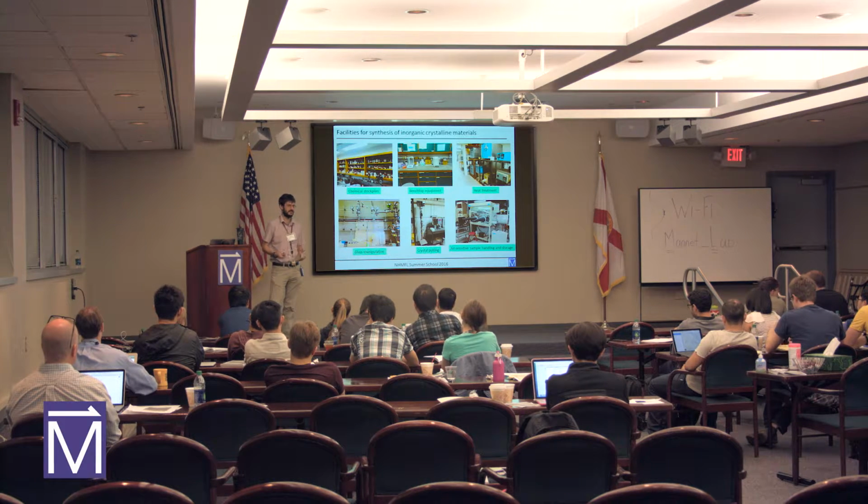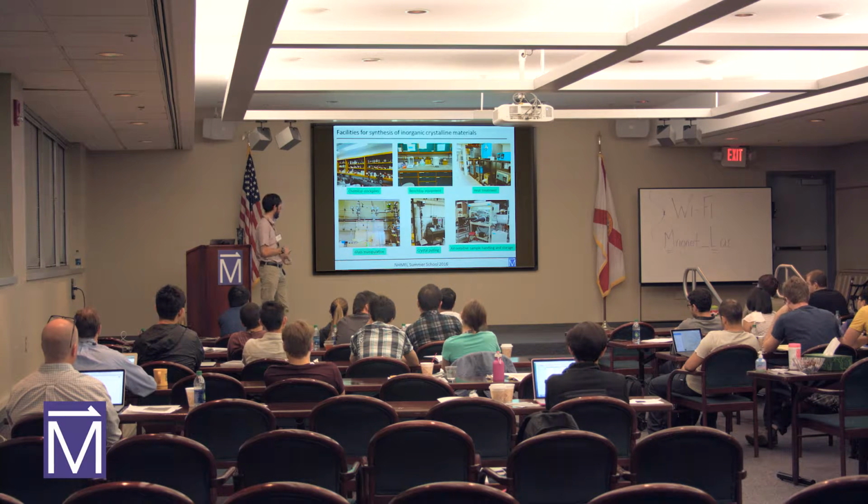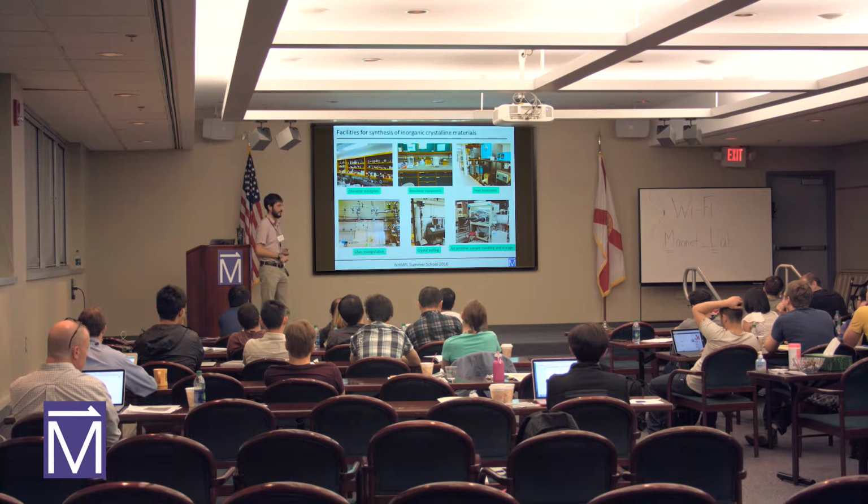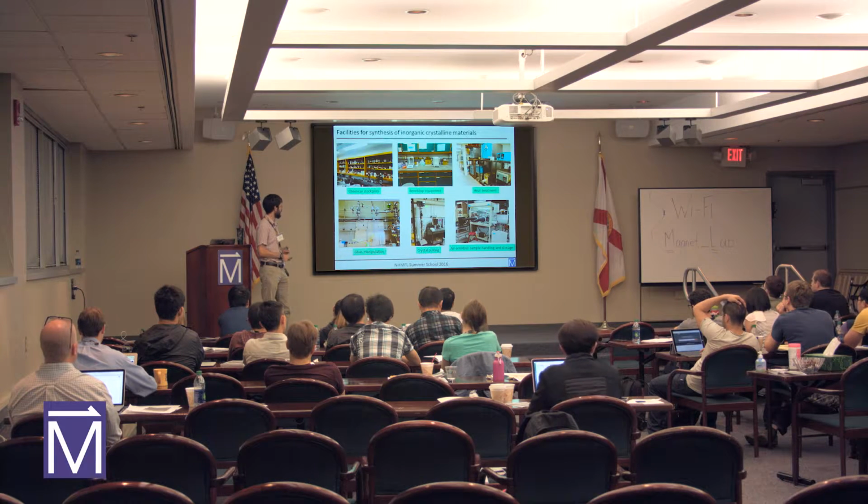That's really hot. But it's an extremely useful tool because what it lets us do is enclose materials, like our starting materials, after we weigh them out, in a quartz tube under argon or under vacuum so that we can do reactions in clean environments. So this is an extremely useful tool, and we can help you out with it anytime. We have more advanced apparatuses, which I'll return to for crystal pulling.